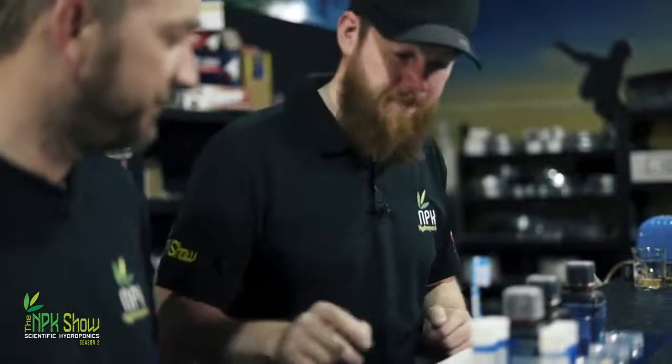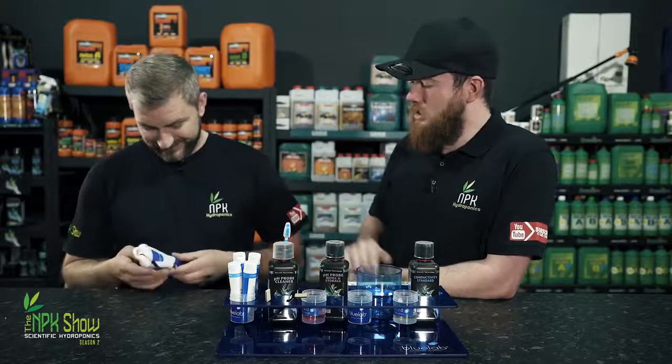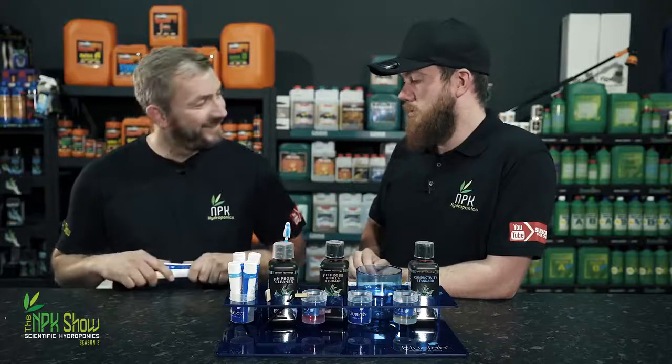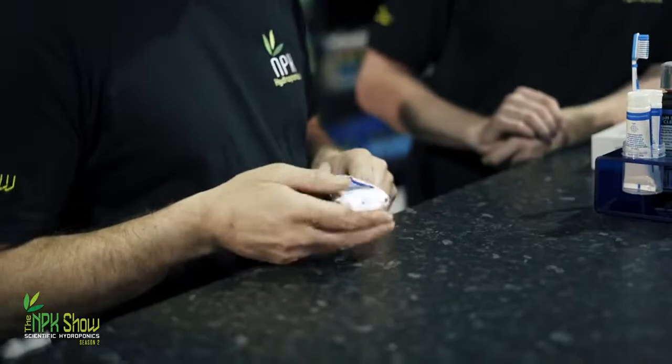Calibrate it. So, tell me what's wrong with this pH pen before we calibrate it, because that's an old one. What have you done? That's just not been looked at. It's not been looked after properly. Can you spot what's wrong with it?